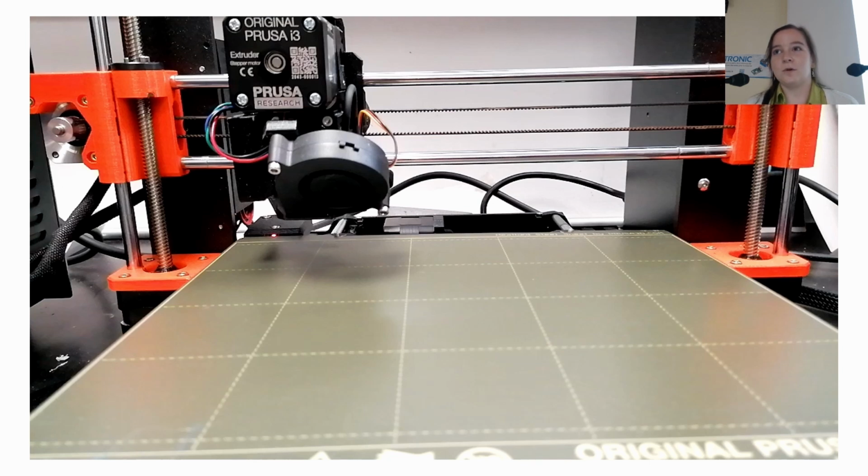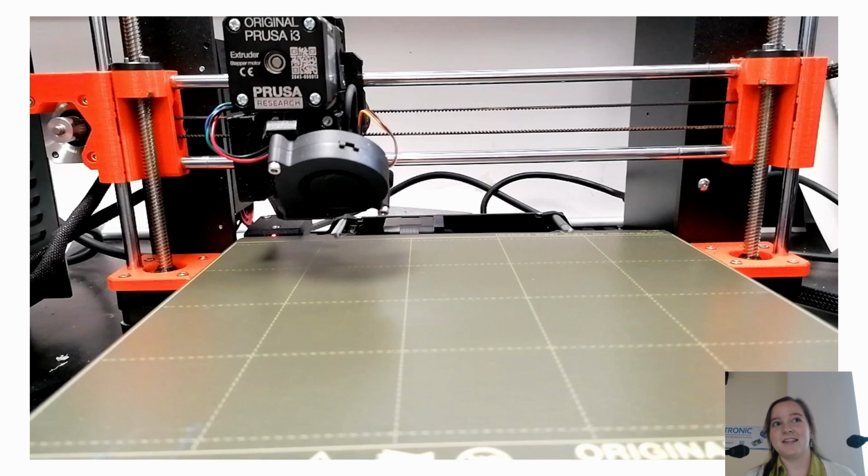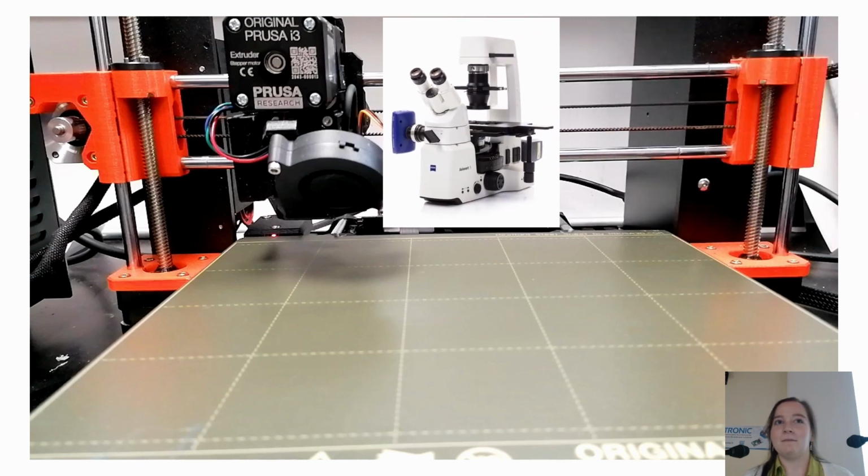It's easily controlled with G-code, and the best thing is that it's already done. I don't have to build it because I've tried building linear translation stages before, and it's just difficult because it has to be perfectly aligned. So I said, maybe we could use the motion of the 3D printer and just put a microscope on top, and then we have a scanning microscope. So that's what we did.